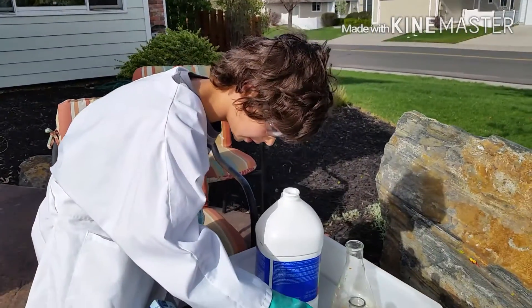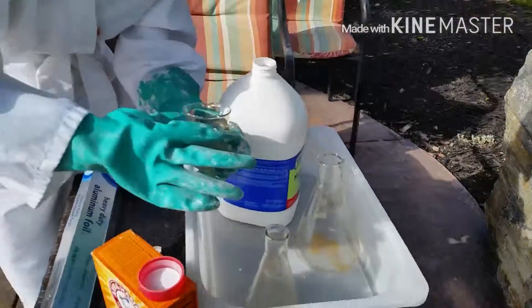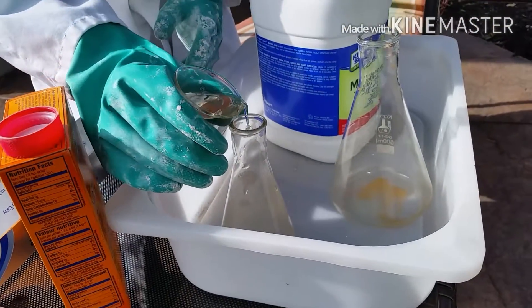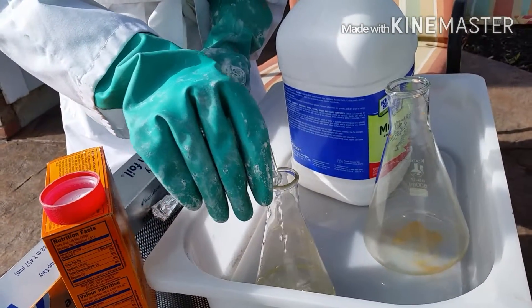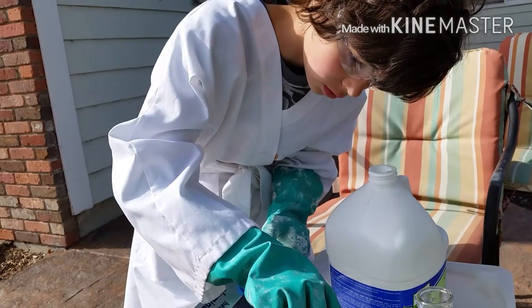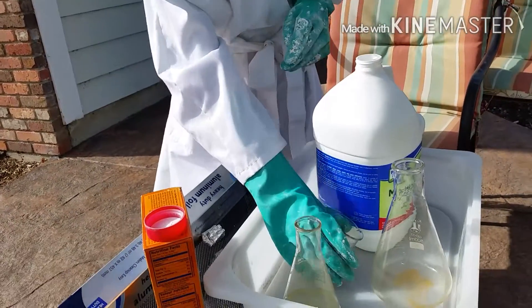I'm going to be putting about 100 milliliters in each flask. Okay, now come back when the next one's ready.